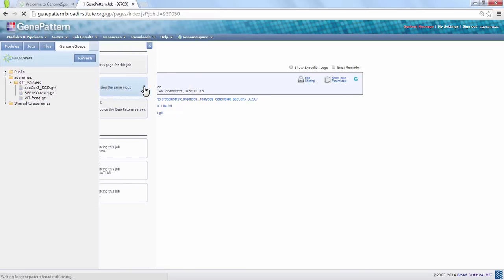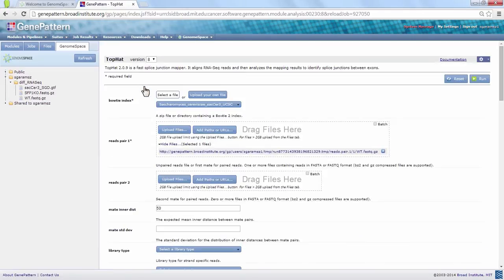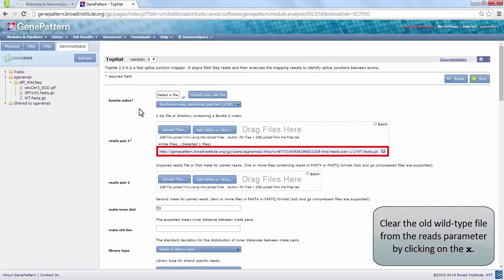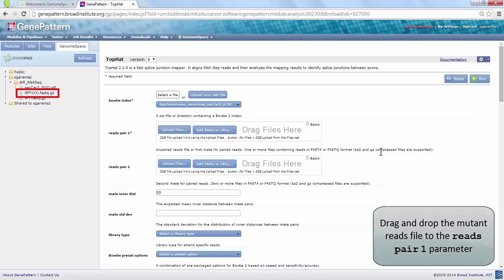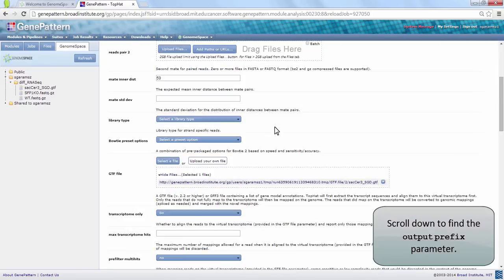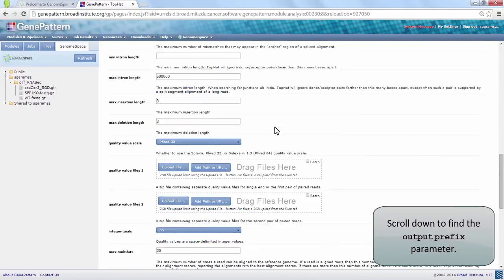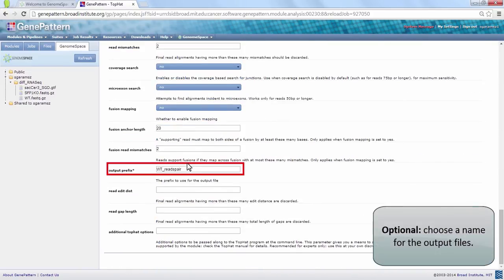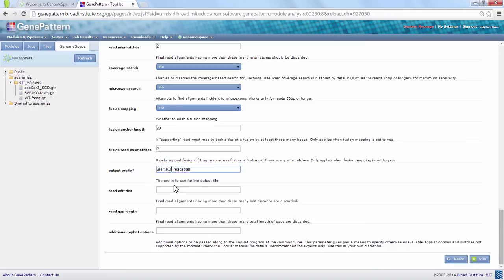To reuse a previous job as a template for a new one, click on the job and then choose Reload Job. Delete the old wild type file by clicking on the X on the right. Click and drag to load the SFP1KO fastq file in its stead. Don't forget to change the output prefix to something like SFP1KO reads pair, so that you can distinguish between the two job results.